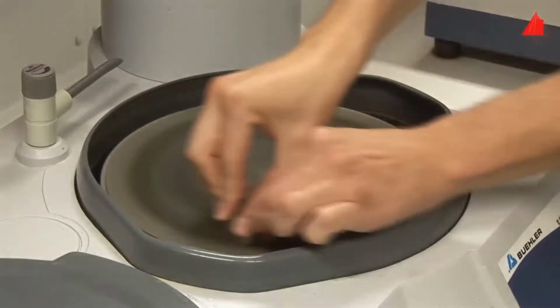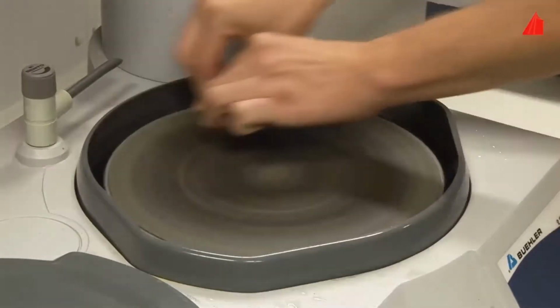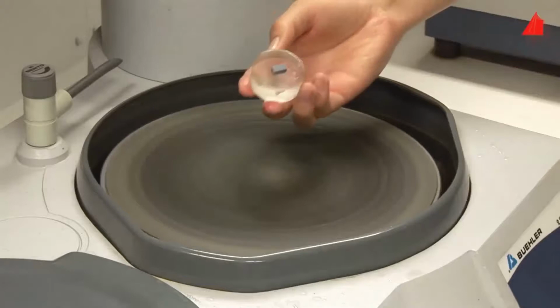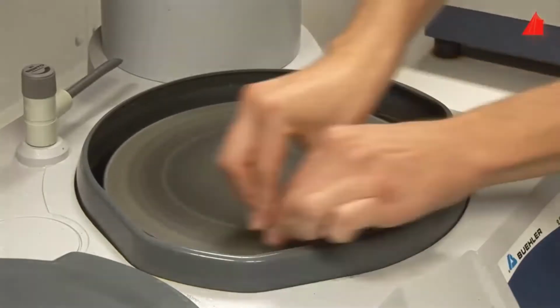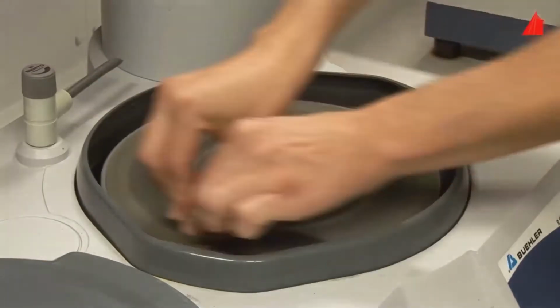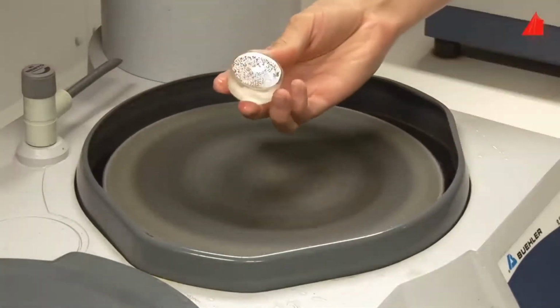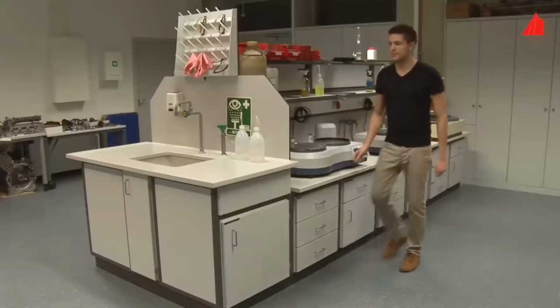Under counter-rotating motion, he presses the specimen with high pressure onto the polishing cloth. The diamond particles have settled on the cloth and are now abrading the surface. After about a minute, all grinding grooves have been removed and the specimen surface already has a shiny appearance. But still there are many fine scratches to be found, resulting from the 6 micrometer diamond abrasive.